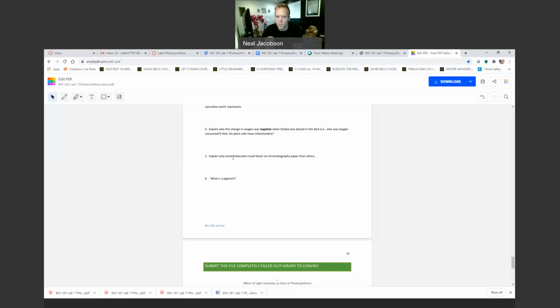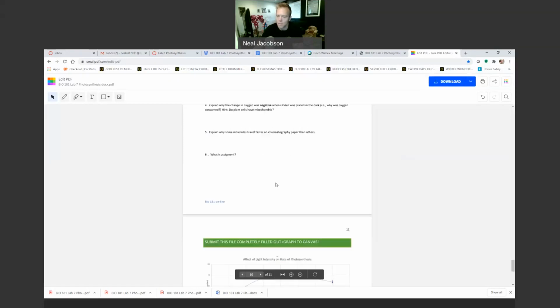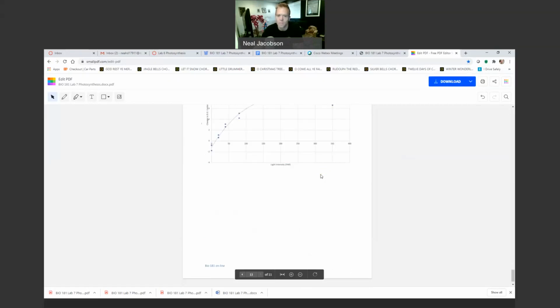Why do some molecules travel faster on chromatography paper? Well, it's because they're smaller and they weigh less. They have less drag. And then what is a pigment? A pigment is any molecule that absorbs a wavelength of light, period. And guess what? You guys are done.